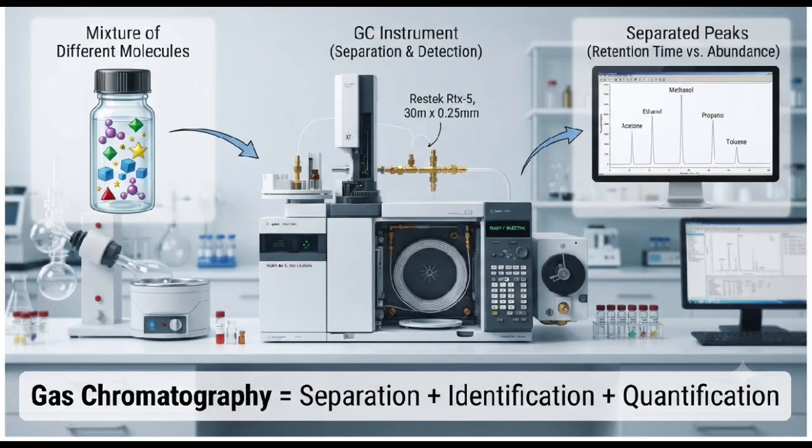Today we are going to follow one sample from the moment it enters the injector until it finally appears as peaks on the chromatogram.